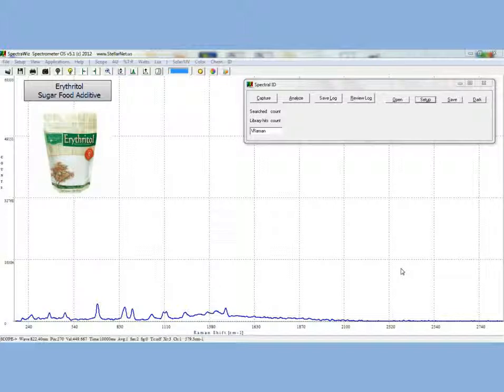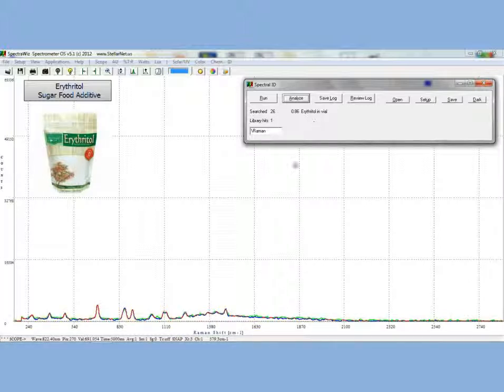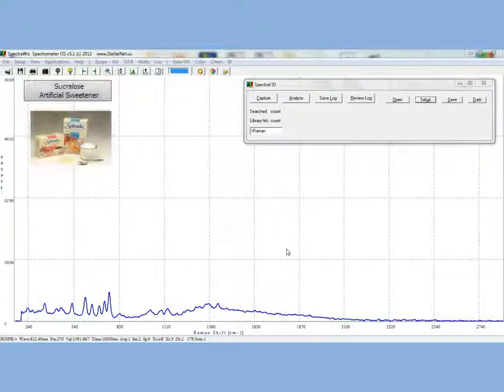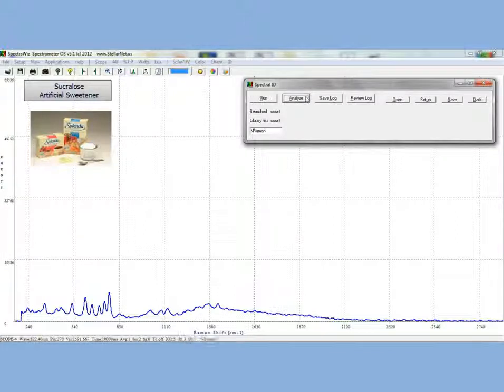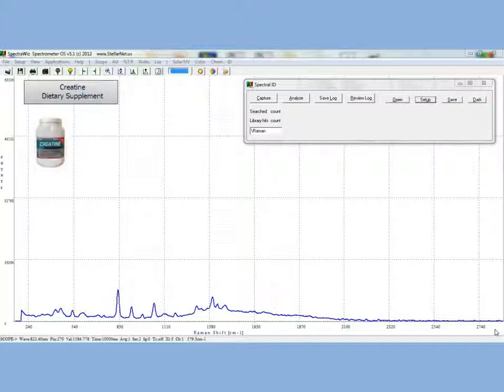Now let's do an example with erythritol, a sugar food additive. Click analyze and we can clearly get the erythritol spectrum. Now let's look at sucralose, an artificial sweetener. Click analyze and we clearly get sucralose in a vial from the library. We can compare the library spectrum with the taken spectrum easily and simply.